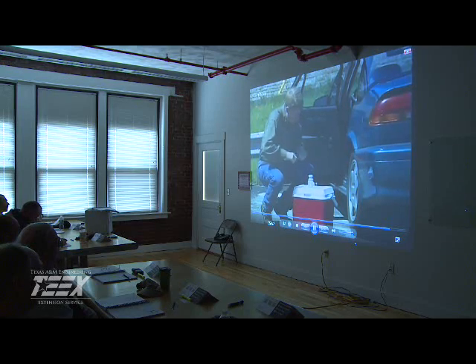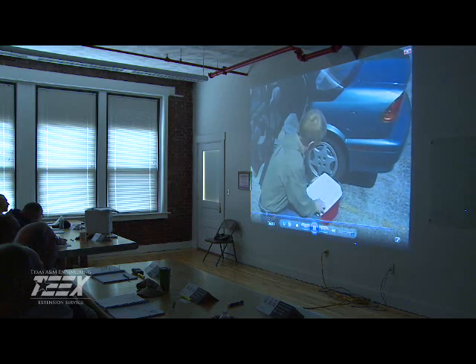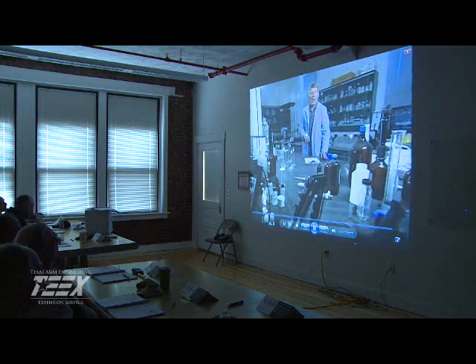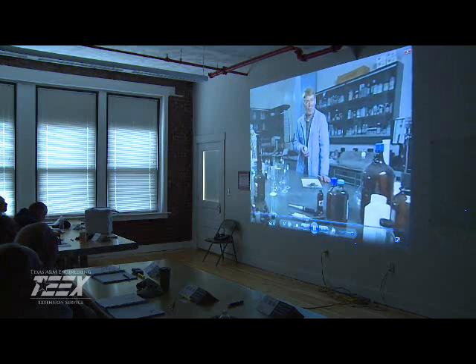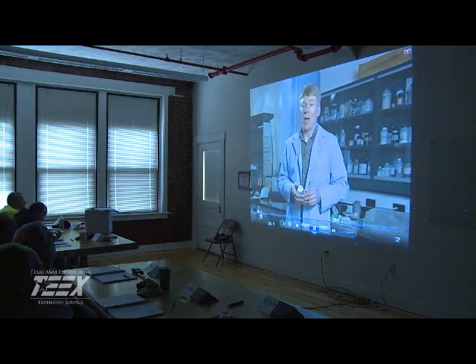All samples are to be analyzed the same day they arrive at the lab. If a sample arrives at a lab on a weekend and isn't processed within the required time, it will be rejected. So collect and ship bacteriological samples early in the week. Also, it's a good idea to collect total coliform samples early in the month. Then, if something goes wrong, there's enough time to resample.